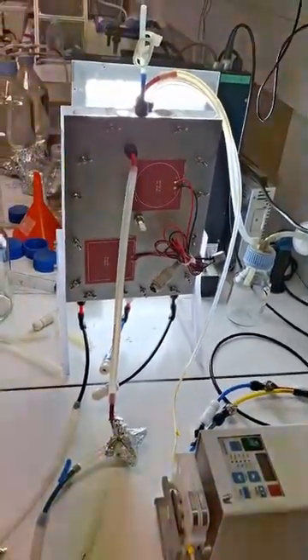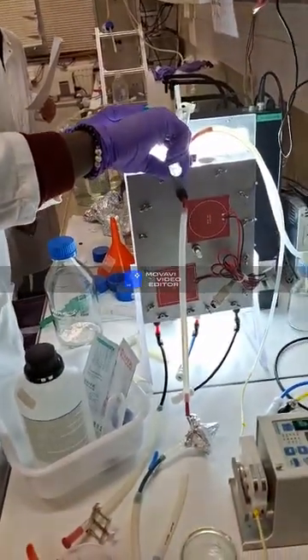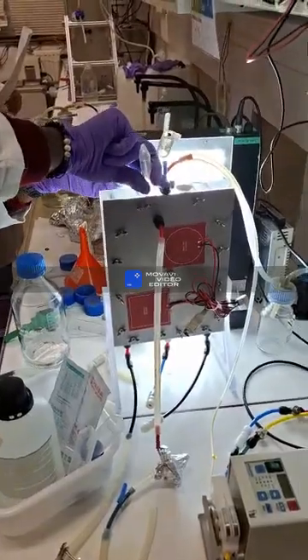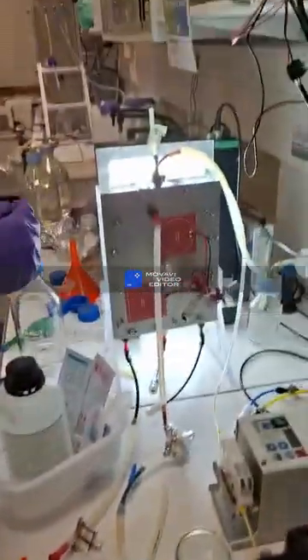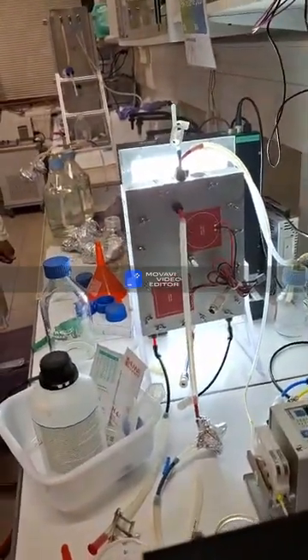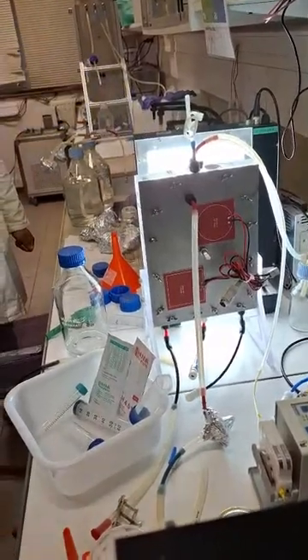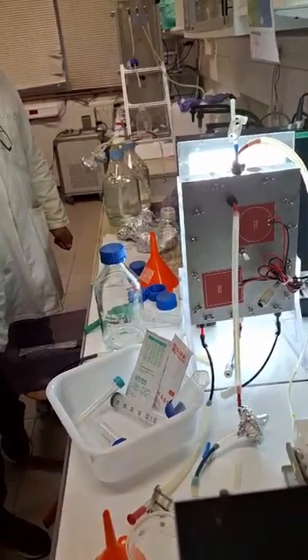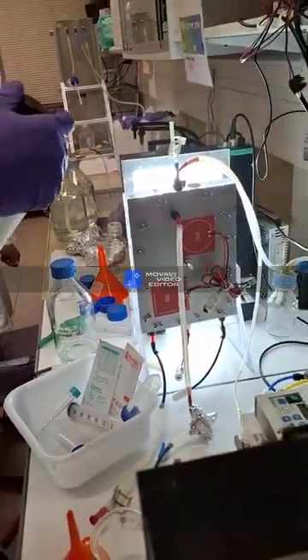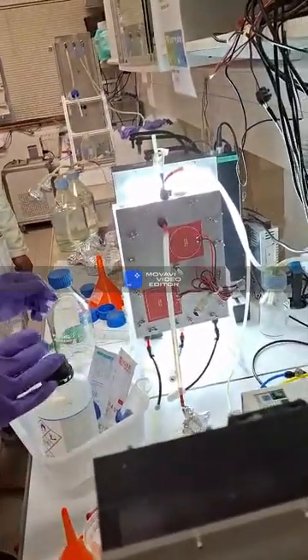And now what should we do? We will add the acid. What's the point of adding nitric acid? It's just to sterilize the PBR. Just that. And it's very concentrated.